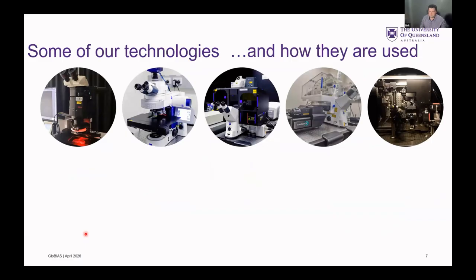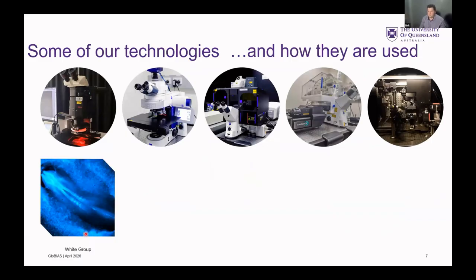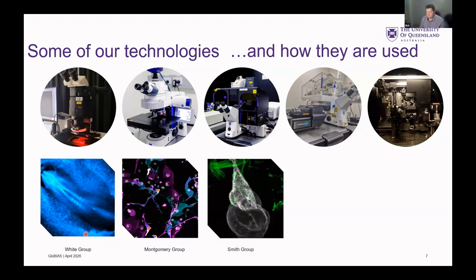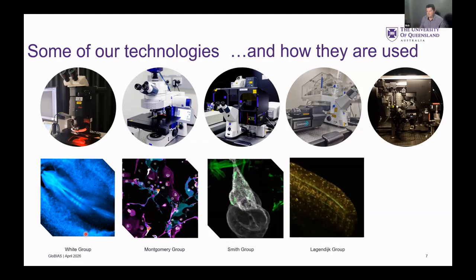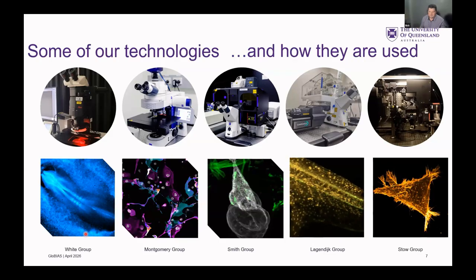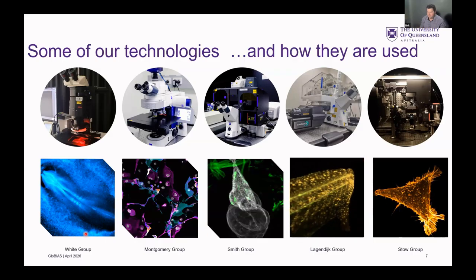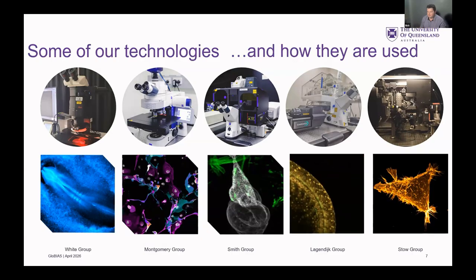They're all light microscopes. But I thought I'd show some of the different things that we do. And so we have quail model organism researchers. They use confocals and stereo microscopes. We have slide scanning, tissue, spatial people, confocal with developmental biology, spinning disk for developmental and high-speed imaging, and the lattice light sheet for cell biology. So already, hopefully, you can appreciate there's a vast difference in what we're doing.